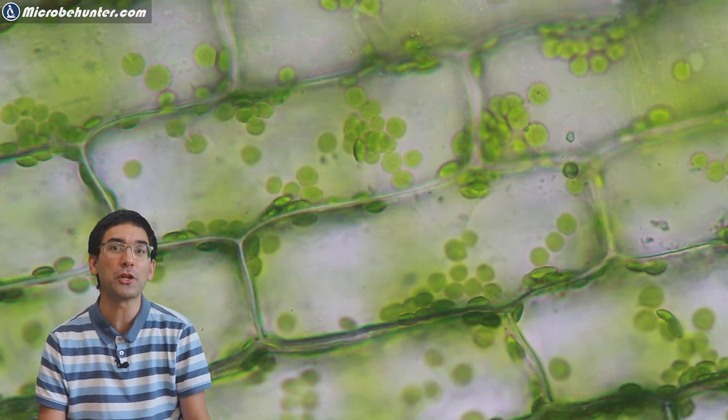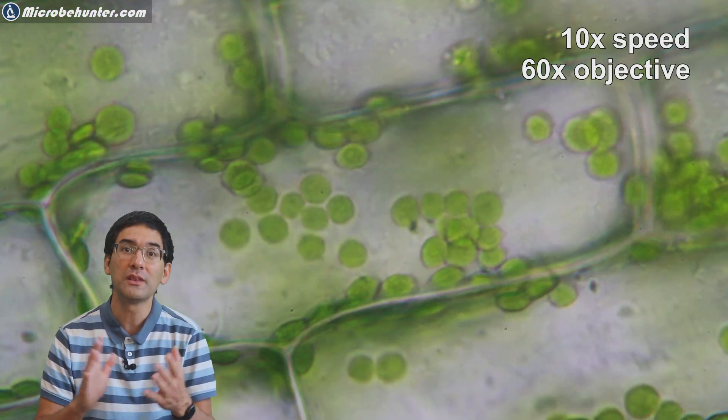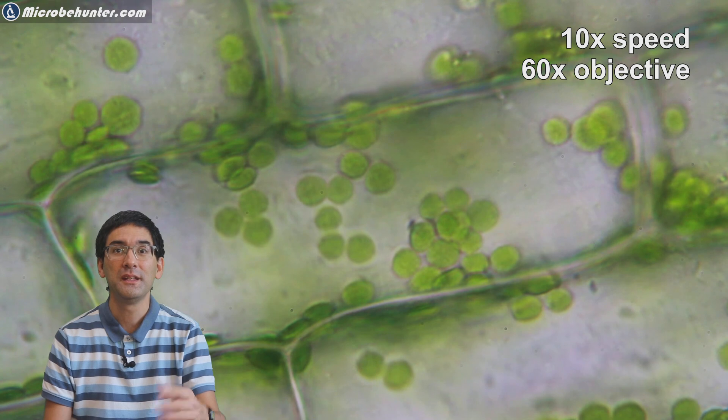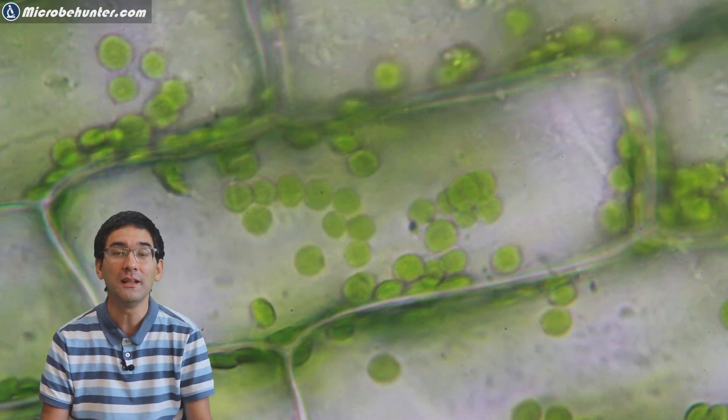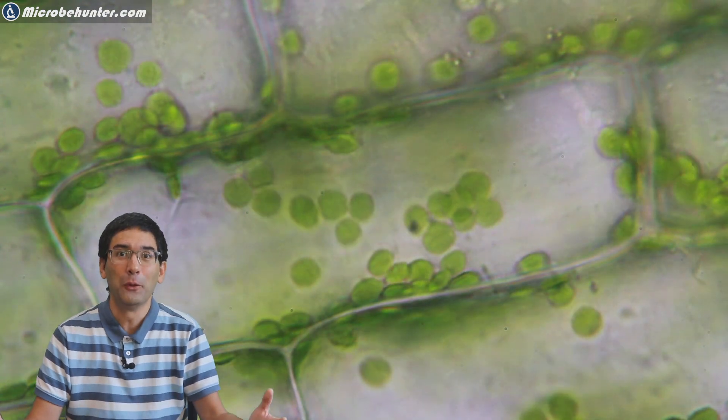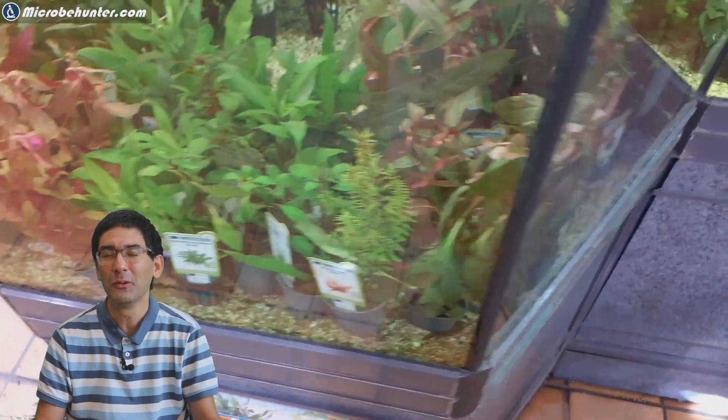And what I wanted to do is I wanted to have a very good look at those chloroplasts. And not all plant leaves are suitable to look at them because many of them are simply too thick. However, this water plant here has the advantage that the leaves are quite thin. But where can I get it from? It's a tropical water plant. So it's not easily accessible. Or is it?